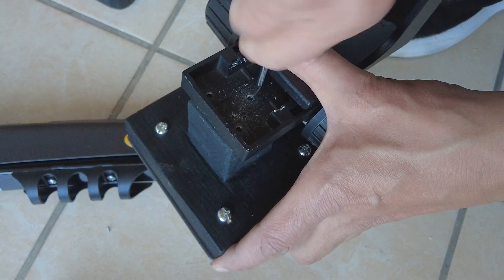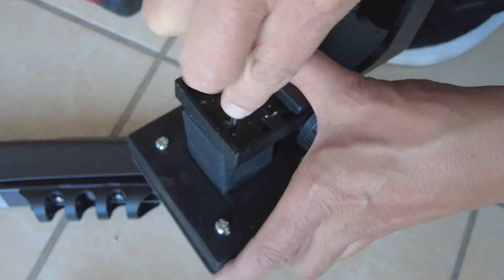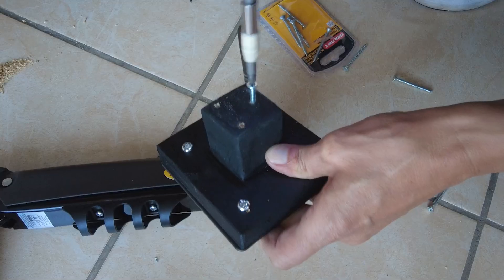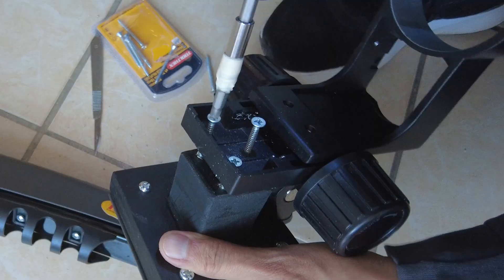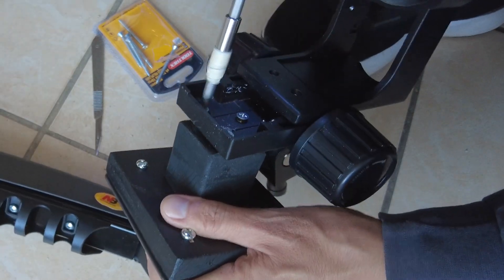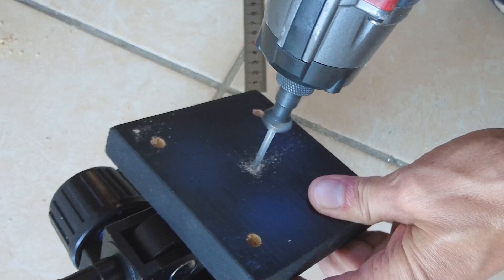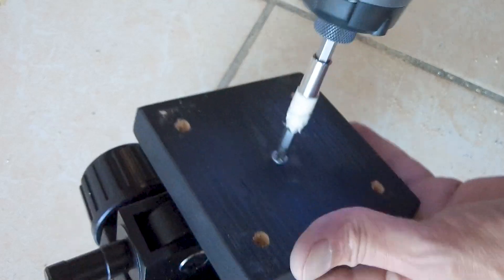Position the new back plate holes to the adapter block. Make sure it is square and central, then mark the hole positions. Drill the pilot holes with a small drill bit to 25mm or 1 inch. Create the full depth of the hole by screwing down the 50mm wood screws and then remove them. Now screw the microscope holding plate to the smaller block. Find the centre of the vessel mounting block on the opposite side and drill a 25mm or 1 inch pilot hole. Then screw in one of the 50mm or 2 inch wood screws.